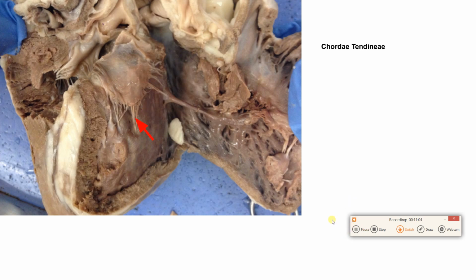See what else we can find. There's one of those chordae tendineae. Remember the valve flaps for the AV valves have a swinging door hinge. We don't want them to flip upward, so we anchor them with these strings of collagen called chordae tendineae. Now, if we follow the chordae tendineae down, we hit a bulging muscle. Bulging muscle like that is a papillary muscle, anchoring the chordae tendineae.